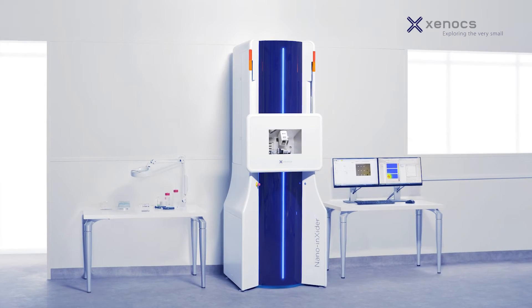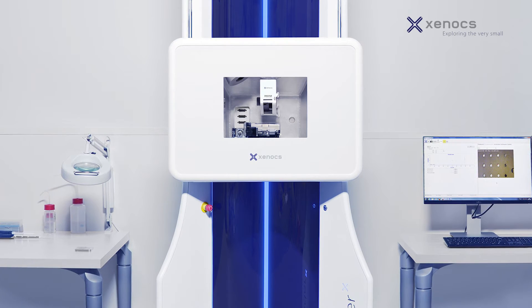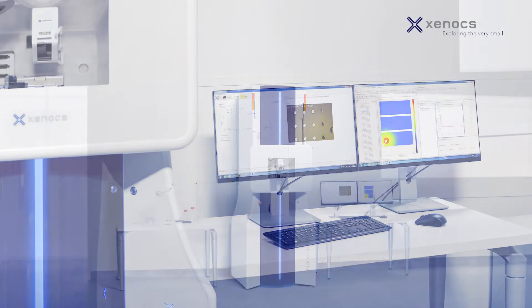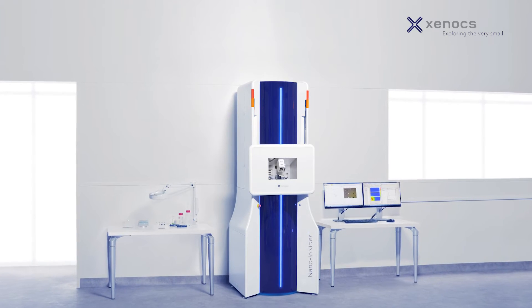People have been thrilled with the new design. They're drawn to the booth because the instrument looks so different and they want to know what it is. And then when they find out that it's a new SAXS system, they say they've been talking about maybe the need for one of these systems. They like the size of it — they can see it fitting easily into their labs. And not needing any external parts is very nice, just needing a plug to plug it in.